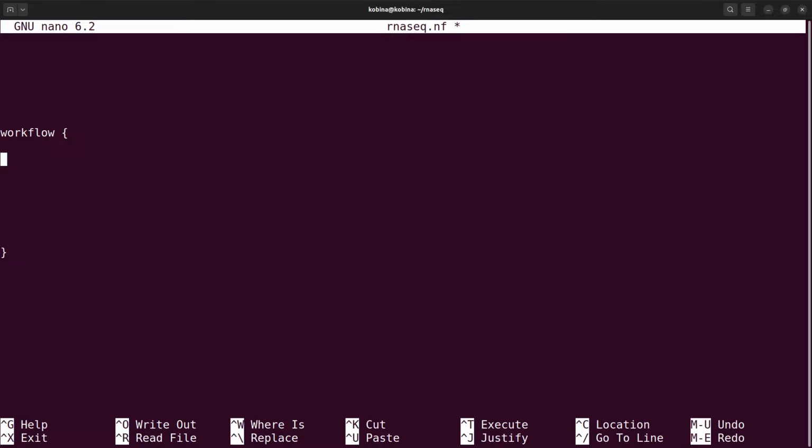With this script, we will need some inputs. One of the inputs we will need is our reference sequence, the FASTA file. We need that information here. So I'll put that here. I have ref_fasta, or FASTA, whichever one you call it.